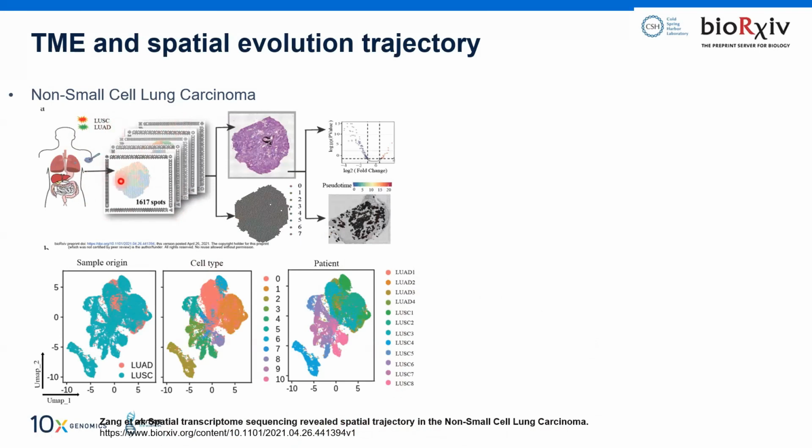And then they did the tissue sections, then the staining, captured the RNA, generated the data, and did the clustering part. Ultimately, the fold change of various genes was analyzed, and they also did the pseudotime analysis so that they can get the trajectory of the various cancer spots moving in that particular tissue section. In this figure, you will see how many types of cells we captured.